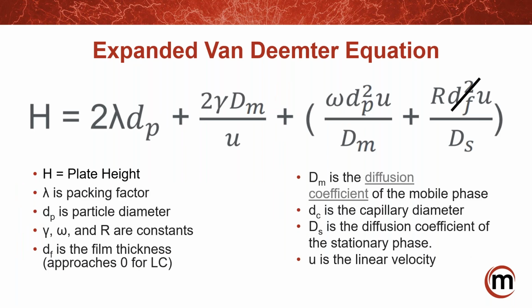But what you need to think about is that when people show these, they don't really break it down into the actual components of the Van Deemter equation. So what we did here was try to focus on, okay, of each of these terms, how do I understand this? It's nice, okay, A, B, C, great. But what if I was to actually look at the math behind it?